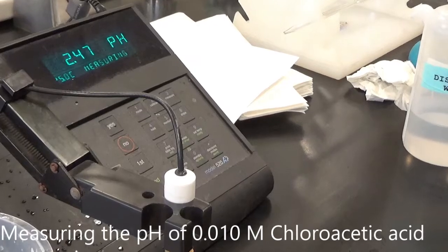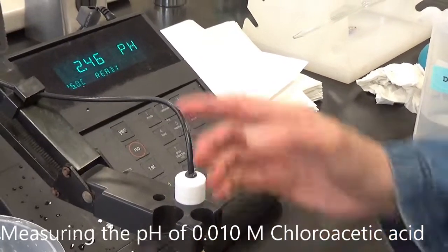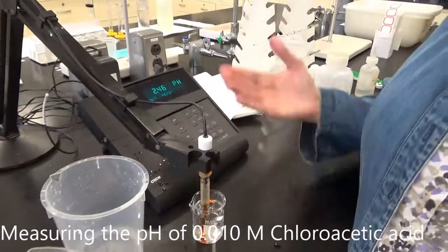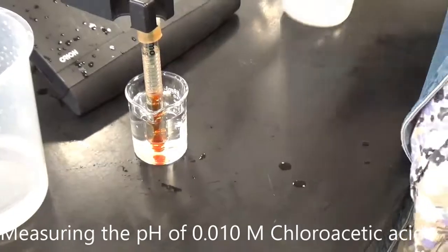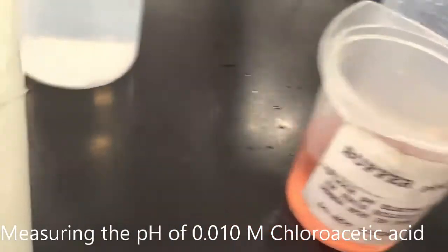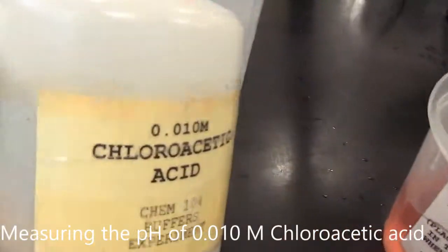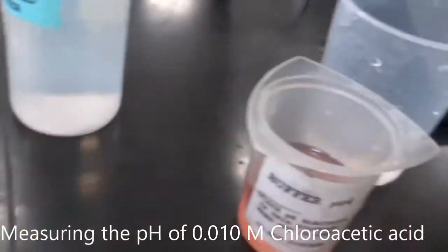Let's call it 2.47 as the pH of 0.010... 2.46, it beeped. 2.46 of 0.010 molar chloroacetic acid. And you might want to compare that to what it was for acetic acid, and what does that tell you exactly? Okay, all right. And that's it.